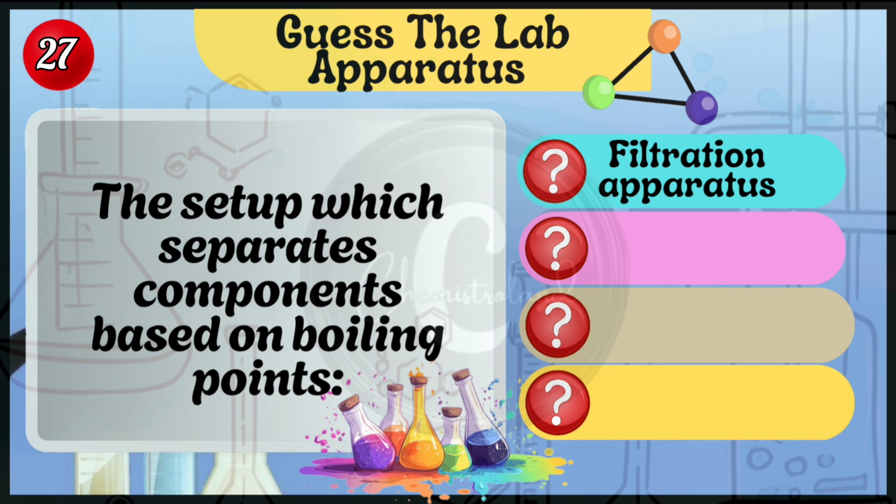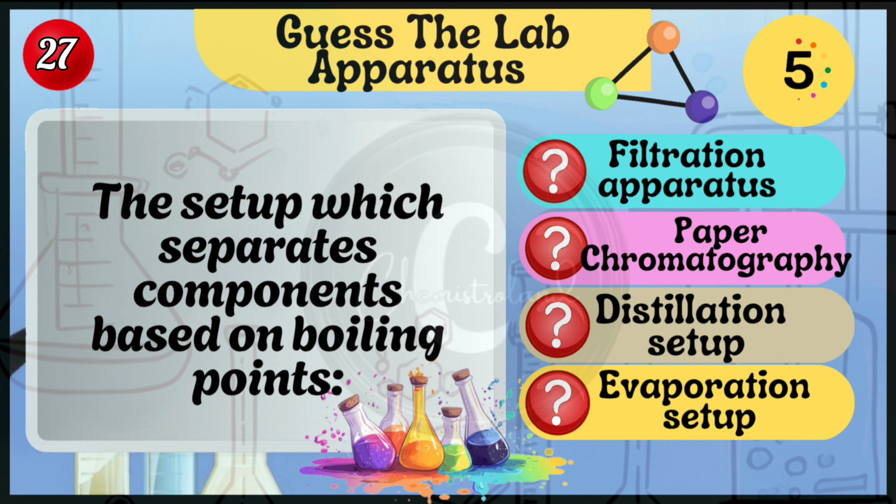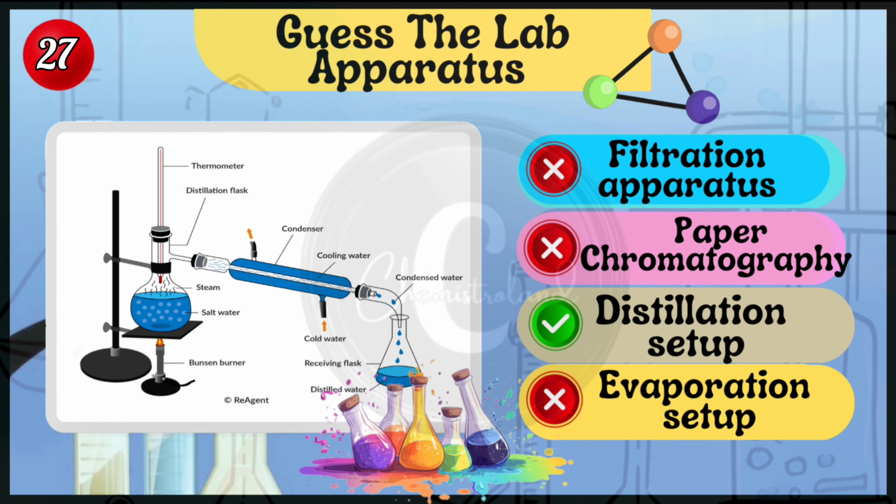The setup which separates components based on boiling points. Options are filtration apparatus, paper chromatography, distillation setup, and evaporation setup. Distillation setup.